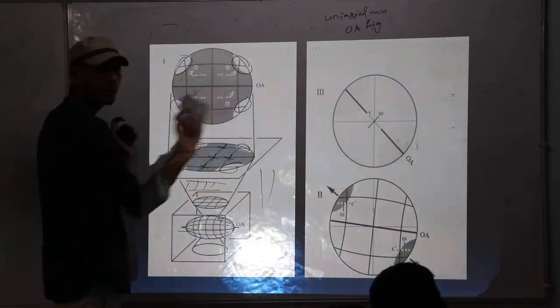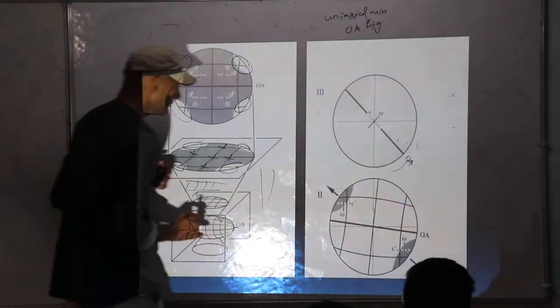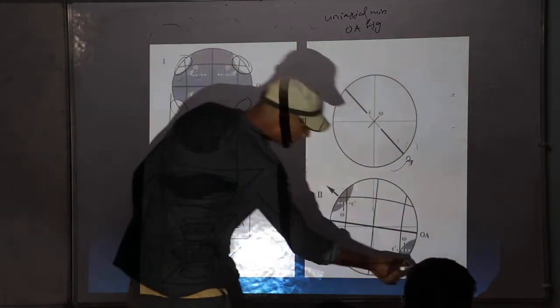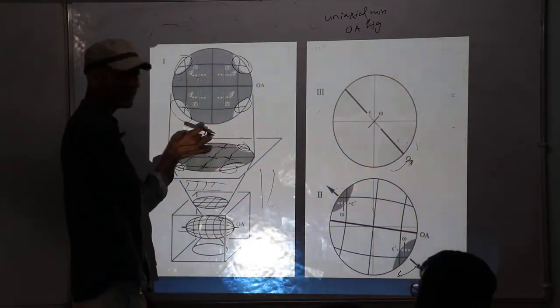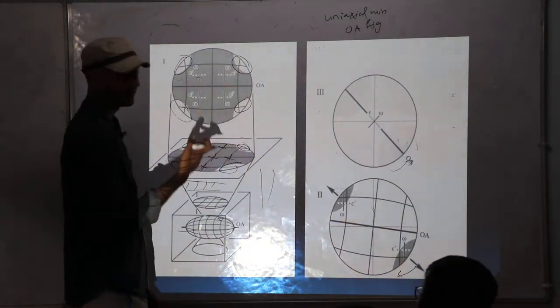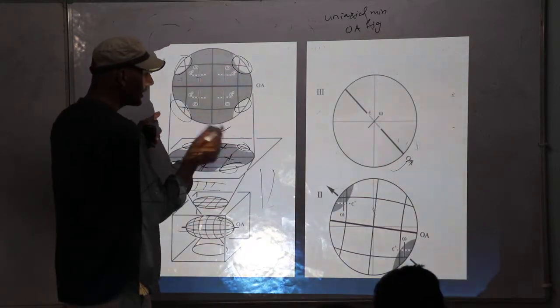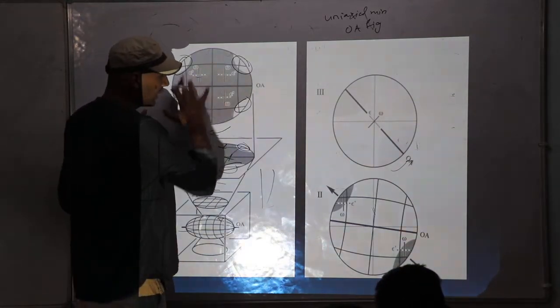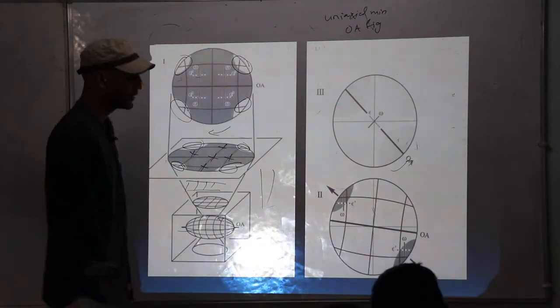If you slightly change the position, slightly rotate the stage, you can see the stage is rotated here, like this. So what happens? If you slightly rotate the stage, all of the vibrations are going to mismatch with the vibration direction of polarizers. The vibration directions of the mineral, in all positions, are going to mismatch with the vibration direction of polarizer and analyzer.